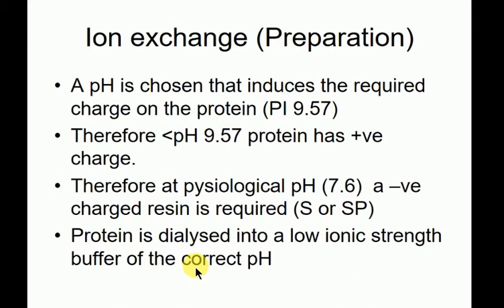And so you put in a set amount of sodium chloride that allows your protein to bind the resin, that doesn't compete. Because as you'd imagine, if your protein is charged and the resin is charged, salt will only compete. So the concentration you want to use would probably be something like 50, 100 millimolar, whereas when you get up to 300 millimolar and above, it's going to come off the resin.